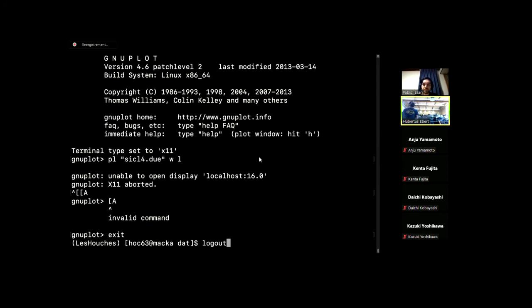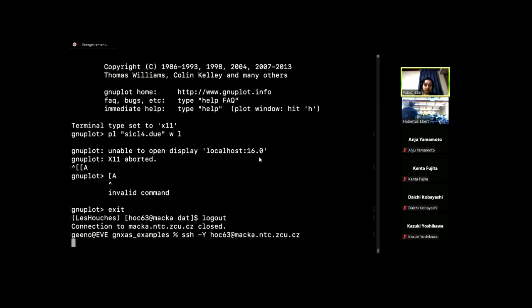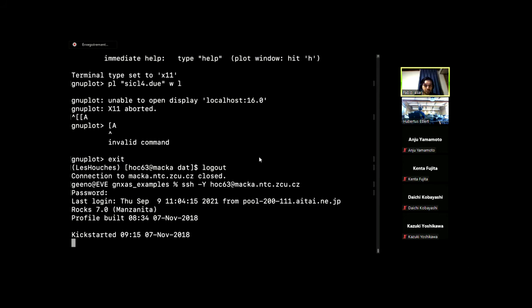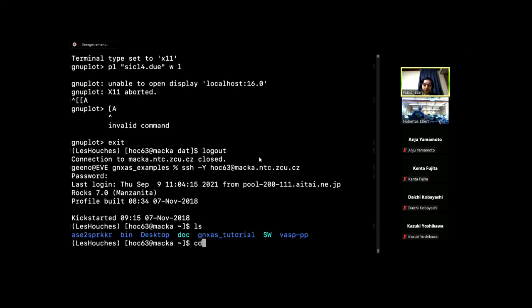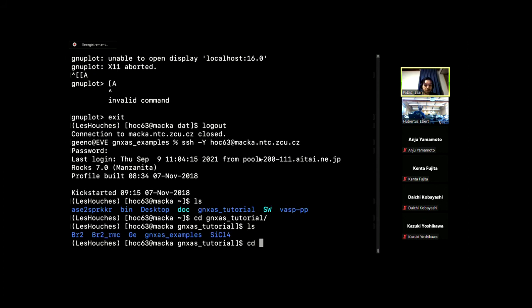But yes, we can open it. Yes. So we have the experimental data. Yes. Okay, let me maybe wait, maybe this way will work.